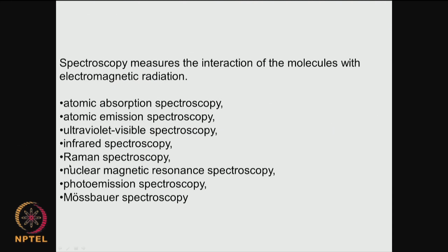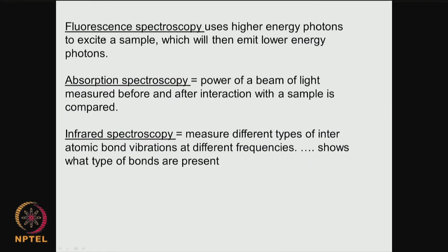So, as I said, again we will spend more time on infrared spectroscopy, because we can look at the functional groups that are present on a surface, and if I do some modifications, what is happening to those functional groups. And as a function of time, if there is an oxidation of your material, we can find out those things using infrared spectroscopy.